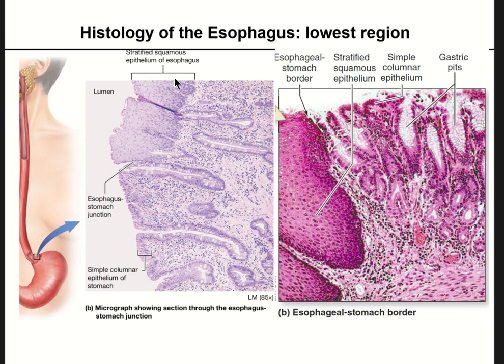Either one is fine. Go with the one that's in your tag list, which I think is gastroesophageal sphincter. Okay. And I can guarantee you really should look at multiple different sources of slides for this junction.